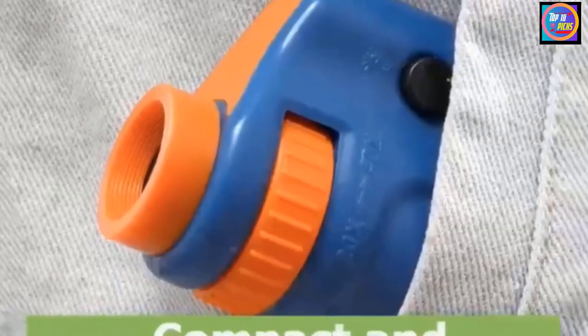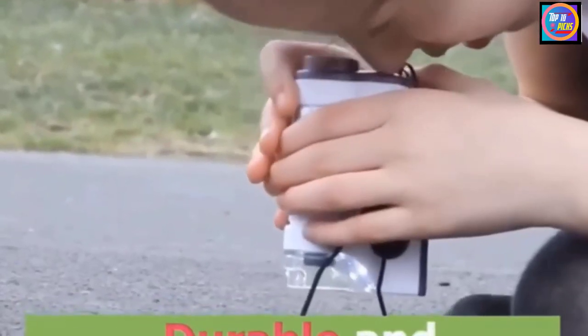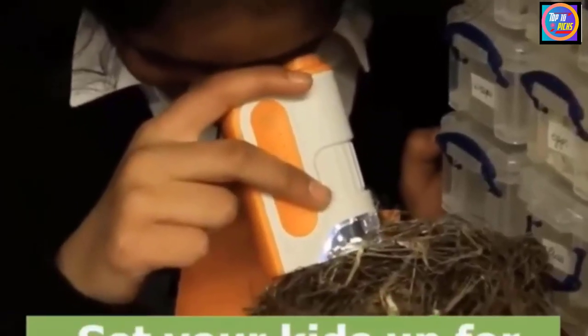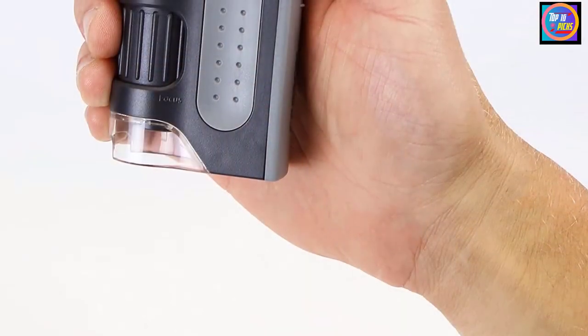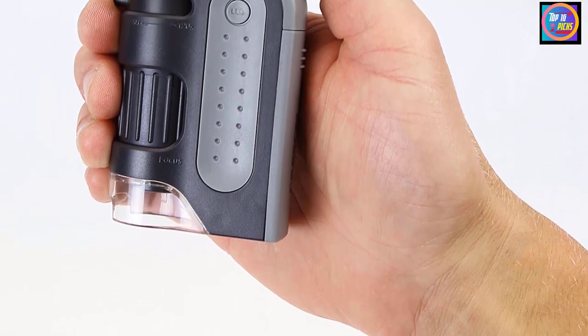To control your focus, a built-in focus setting is easy to use while you're looking at your object and doesn't flicker between settings. Fabric, currency, rocks, and plants show up great under this microscope since these objects don't move, so you don't need to obtain them on slide pieces.